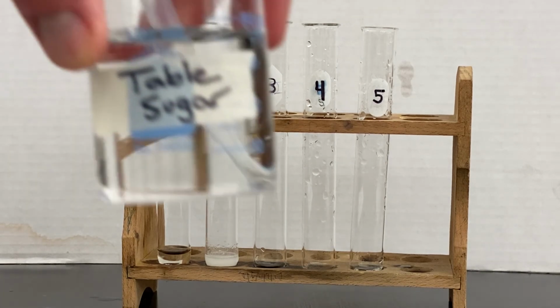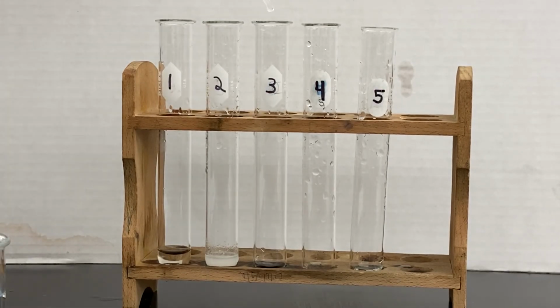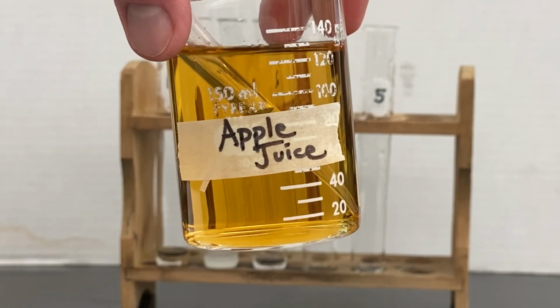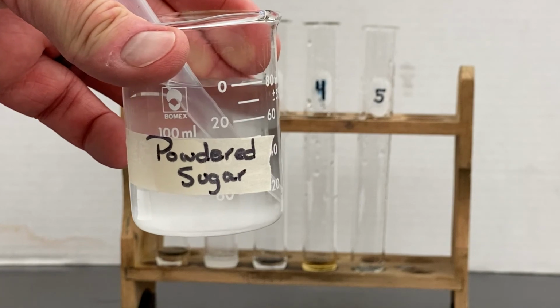My table sugar solution to test tube number 3. My apple juice to test tube number 4. And finally, the powdered sugar to test tube number 5.